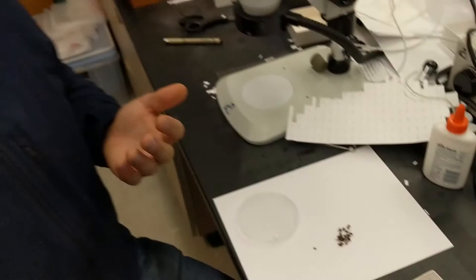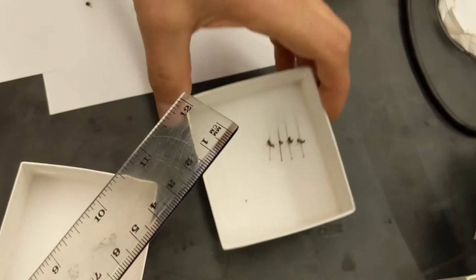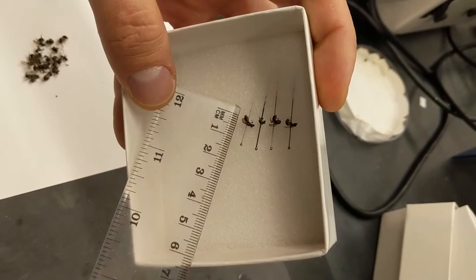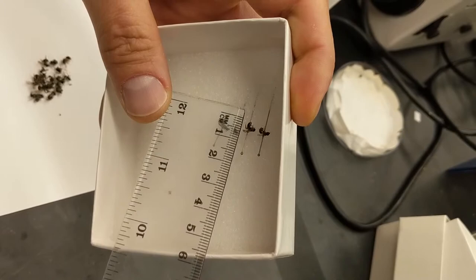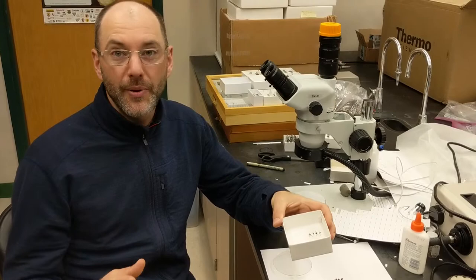One thing you'll notice here is that I'm not using a pinning block or anything to set the height of the specimen. I've glued tens of thousands of bees — let's just take a look at the height. That one's around eight mil, that one's around nine, that one's around eight, that one's about seven.